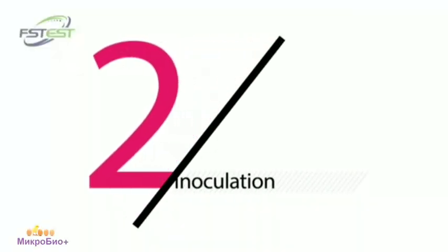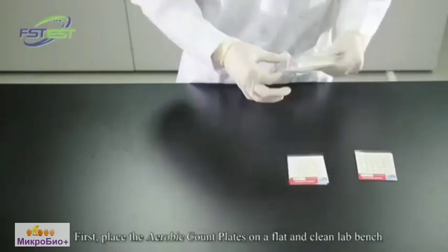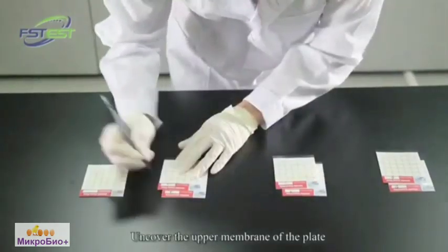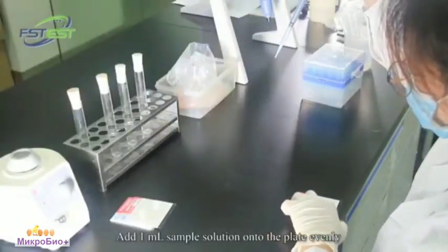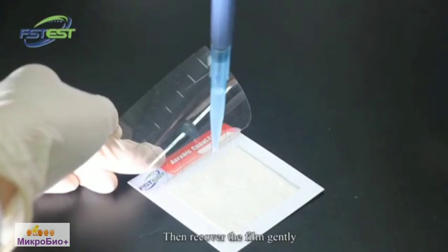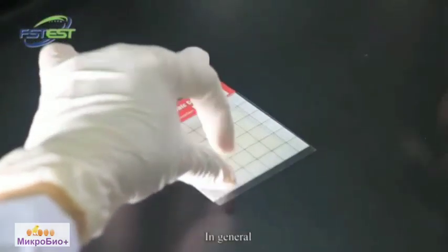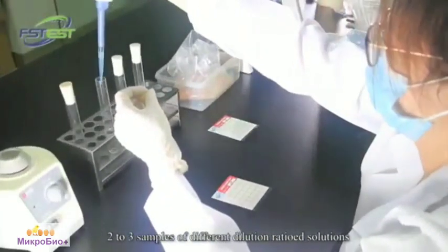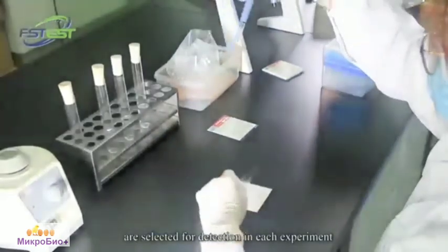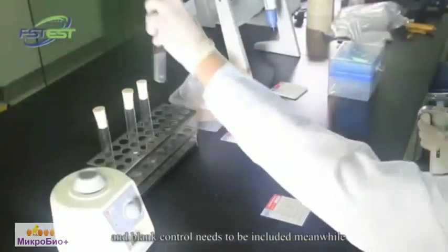Inoculation. First, place the aerobic count plate on a flat and clean lab bench. Uncover the upper membrane of the plate and add 1 milliliter of sample solution onto the plate evenly. Then recover the film gently and wait for around 10 seconds until the medium becomes solid. In general, 2 to 3 samples of different dilution ratio solutions are selected for detection in each experiment. Inoculate 2 plates for each dilution, and a blank control needs to be included.